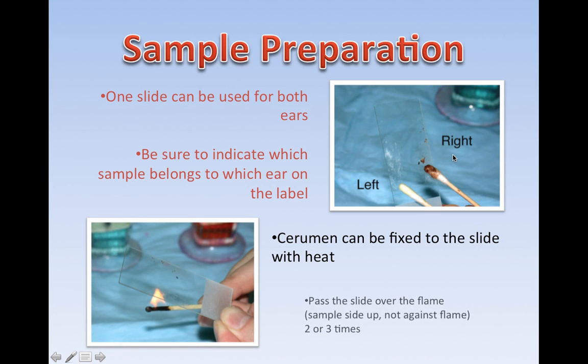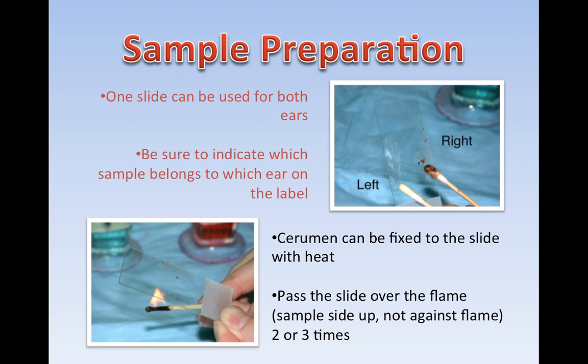Cerumen, which is wax, can be fixed to the slide with heat if you choose. Pass the slide over the flame, sample side up. Do not burn your sample — I've totally done it. It helps to label your slide ahead of time. Pass the slide over the flame two or three times. Don't do it too much because you can heat up and destroy the cells, and you can also get black soot on the underside of the slide, which you can wipe off.